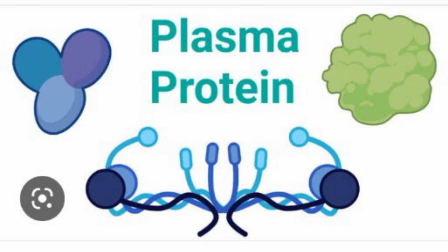Sakaguchi test. This test is specific for arginine, which contains the guanidino group. Procedure: 3 ml of unknown solution, add 3 drops of 40% NaOH, 5 drops of alpha naphthol and a few drops of bromine water. Red color appears if the solution contains arginine.